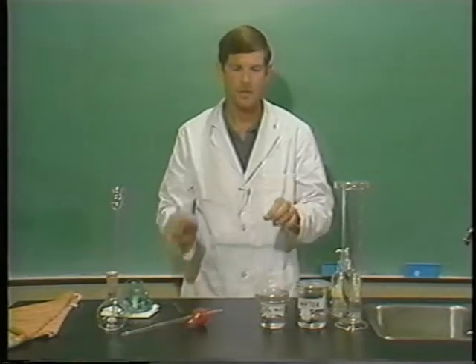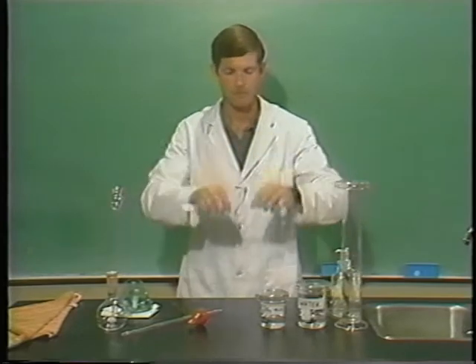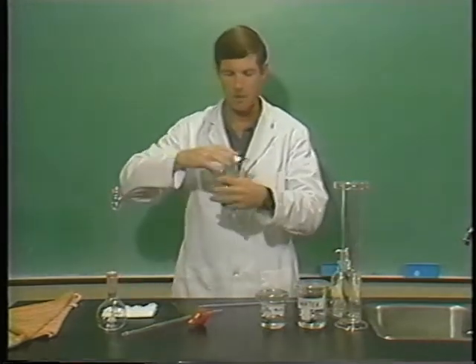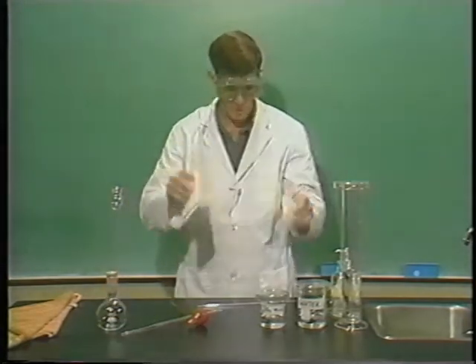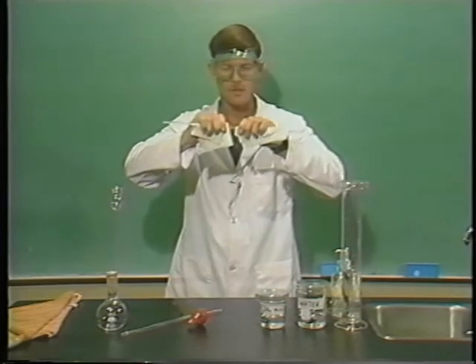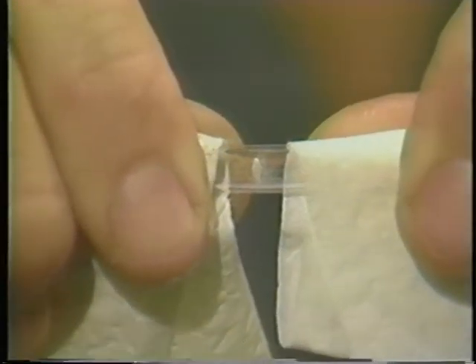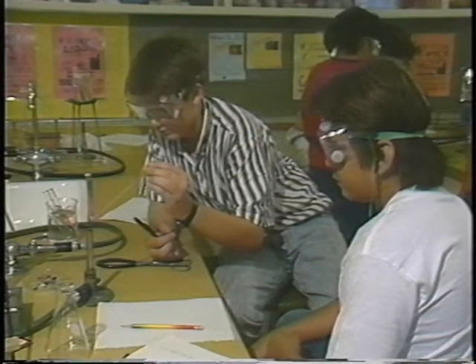Step number two is to snap it by holding the scratch mark away from you and bending the glass tubing. But let's be a little bit on the safe side, put our safety goggles on, and hold the glass tubing with two pieces of paper towel. So let's point the scratch mark away from us and snap the glass tubing. As you can see, there's still sharp edges on this glass tubing, so the next step is to fire polish it. We do that by holding it in the flame of a Bunsen burner and melting the glass just a little bit and smoothing out the edges.